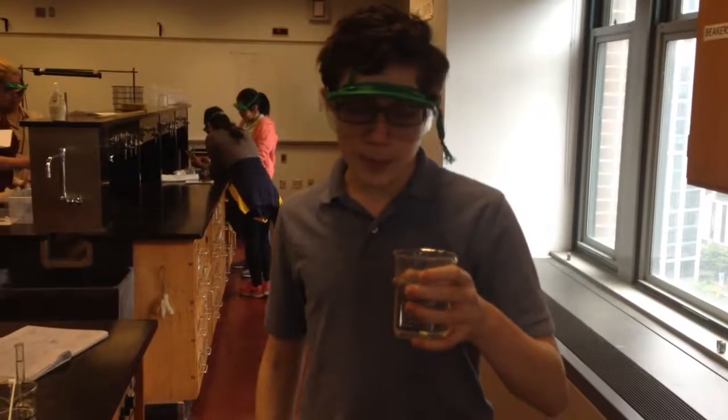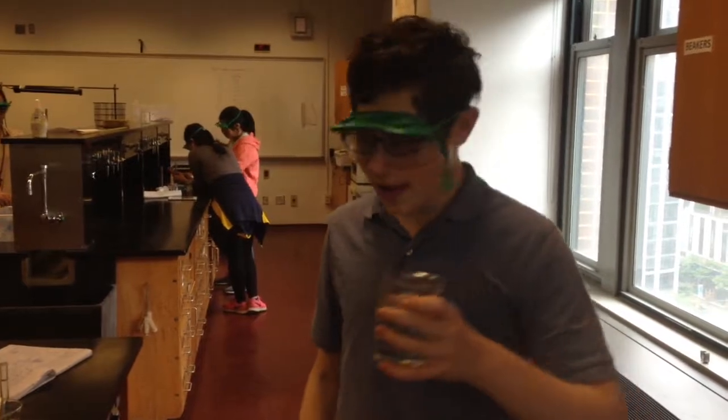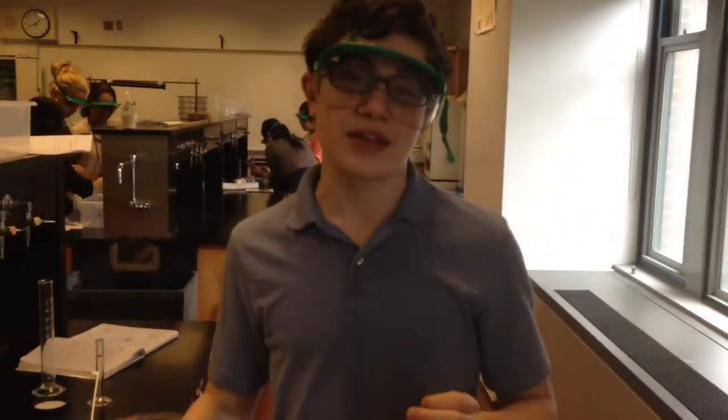To prepare a cold water bath, we're going to need to take one of our beakers and fill it 2/3 of the way with water. As for our hot bath, we're going to take our other beaker and fill it 1/2 of the way with water and then place it on our hot plate.